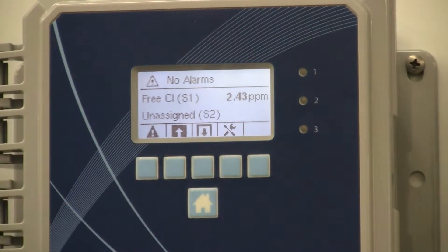We are going to calibrate the chlorine sensor on the W100. We just ran our DPD and it shows 5.3 ppm, so we are going to calibrate to 5.3 ppm.